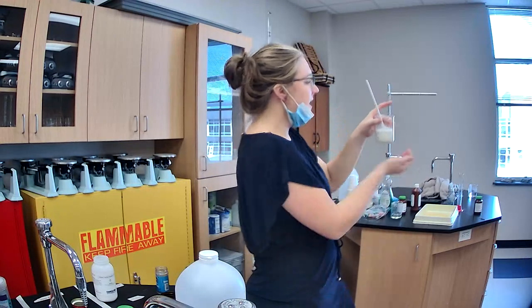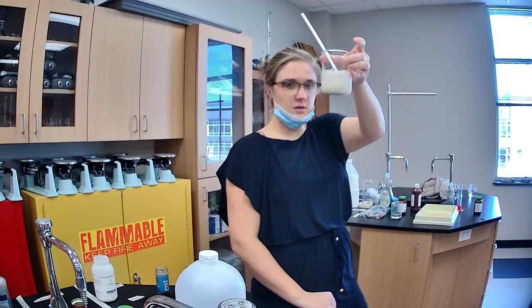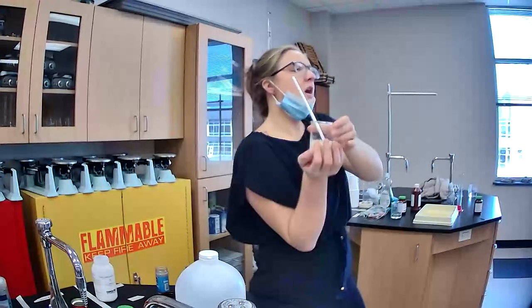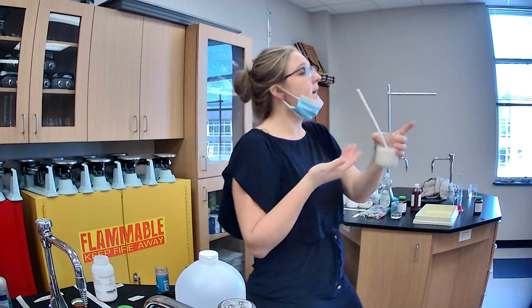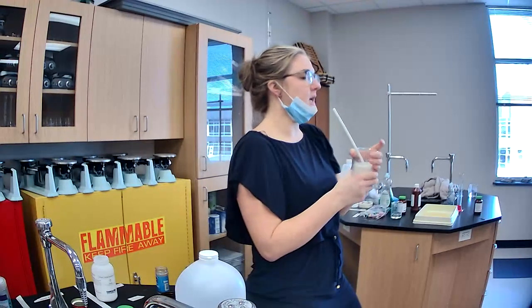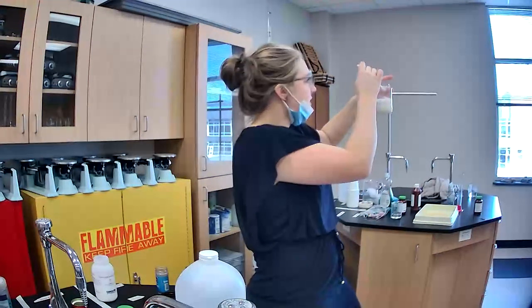Now, technically, this should be an exothermic reaction. It should cause the glass to heat up, but I don't think we have enough reacting for it to do that. But it would be exothermic. But you can even see now how it's foaming a little more than it was?